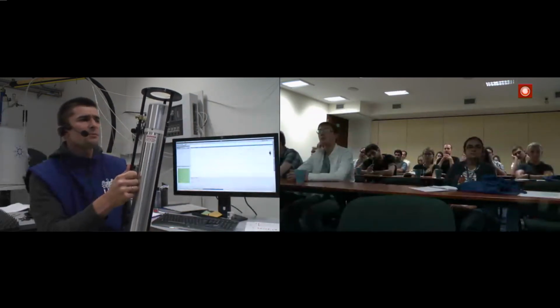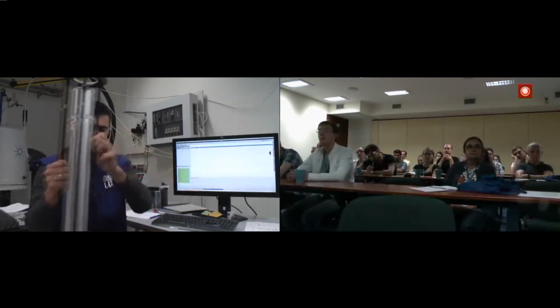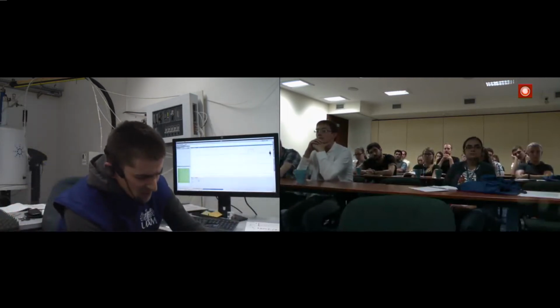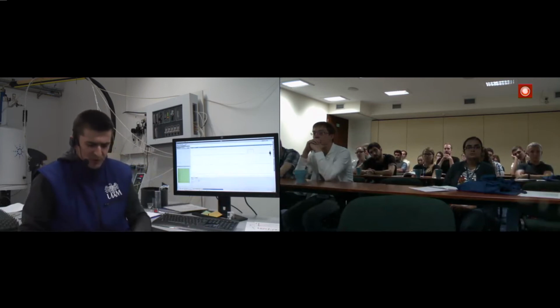It's necessary because, as Zbigniew mentioned, we would like to mimic liquids, right? So we'd like to introduce certain motions.